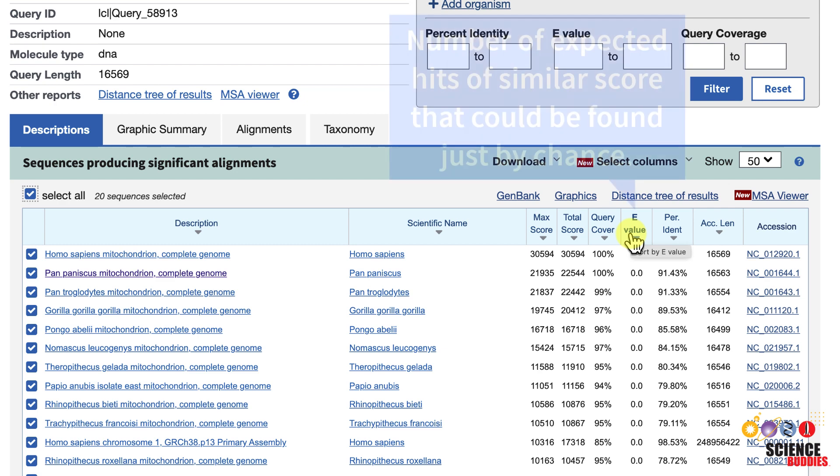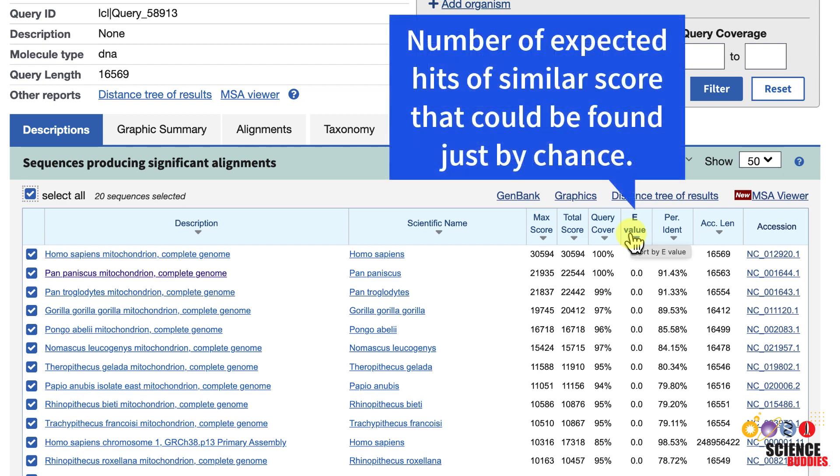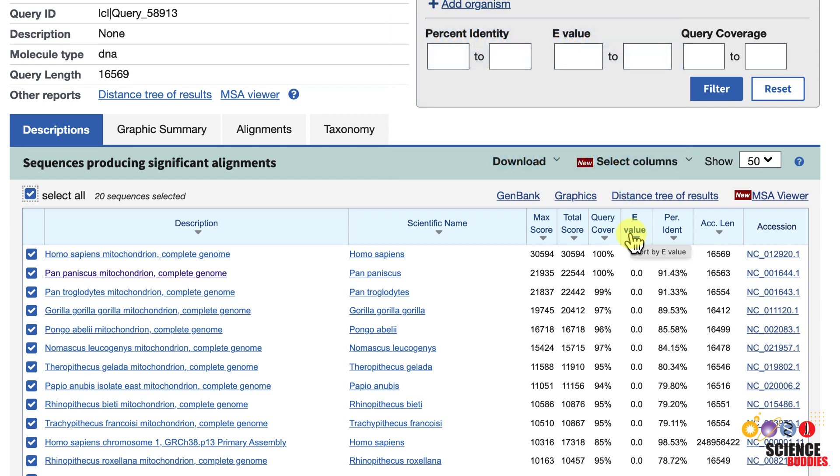The e-value is the number of expected hits of similar score that could be found just by chance. For example, an e-value of 10 means that up to 10 hits can be expected to be found just by chance, given the same size of a random database. The lower the e-value, the more confident you can be that the result sequence is not a random hit.